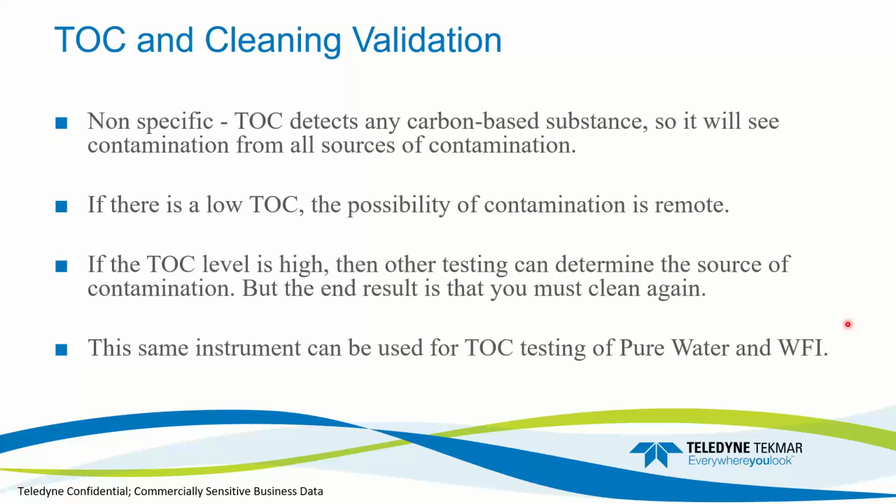But the end result is you still must clean again. So if your TOC level is high, you can continue to investigate where that's coming from, but you still have to clean your vats. You're going to have to clean your processes again. So that's a good thing to see. The same instrument can be used for TOC testing of pure water, water for injection. The fusion system can be used for many facets within the pharmaceutical process other than cleaning validations.